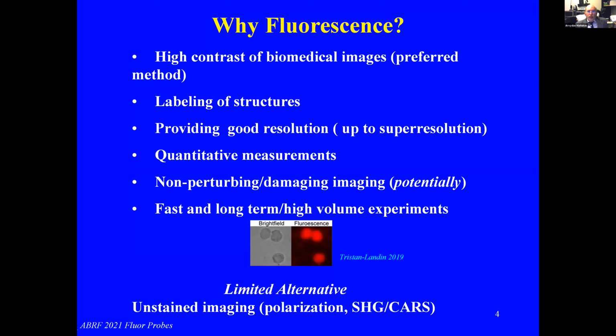Also, it provides good resolution, provides quantitative measurements, allows non-perturbing imaging with some limitations, and also allows different types of experiments, either fast or long-term and even high-volume.